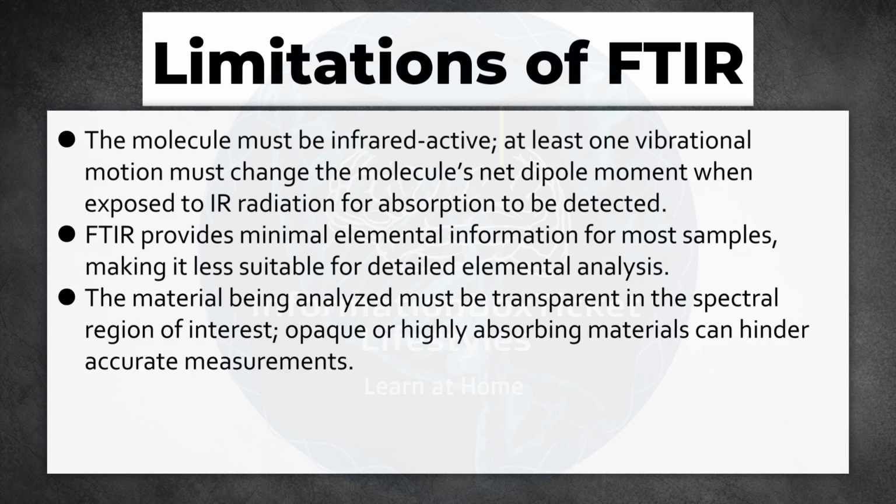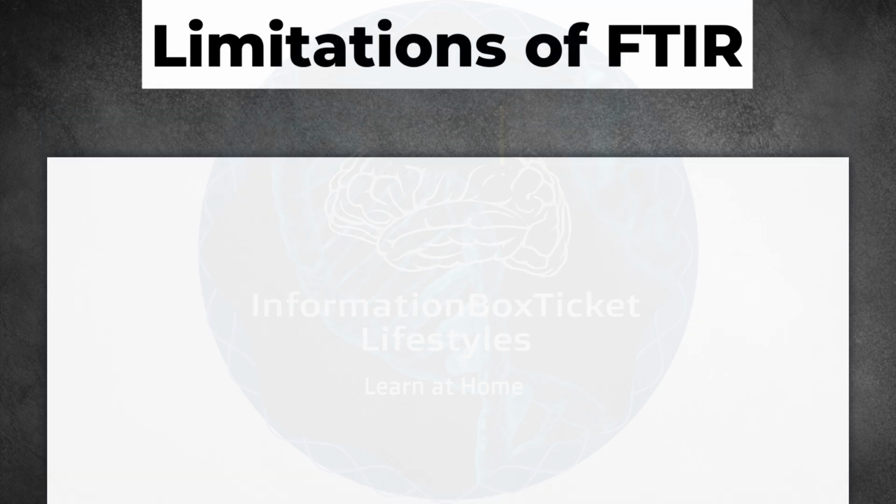The material being analyzed must be transparent in the spectral region of interest. Opaque or highly absorbing materials can hinder accurate measurements.